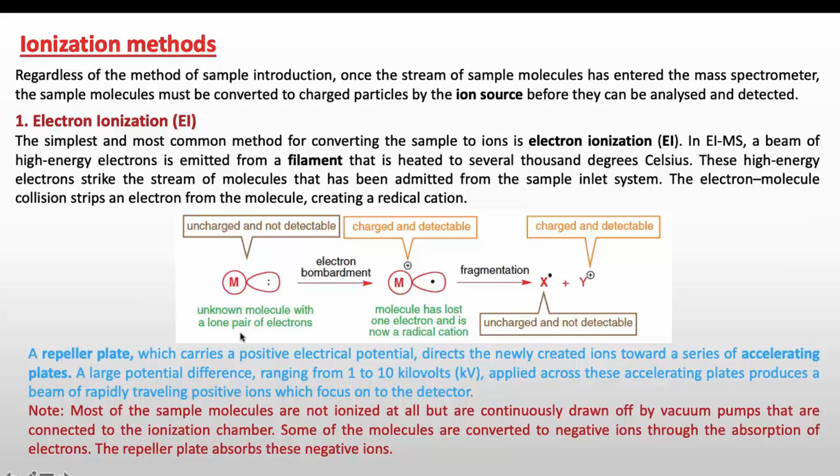The radical cation or cation is useful for us because the mass detector can detect only ions, not radicals or neutral molecules. Now a repeller plate which carries a positive electrical potential directs the newly created ions towards a series of accelerating plates, and a large potential difference ranging from 1 to 10 kilovolts applied across the accelerating plates produces a beam of rapidly traveling positive ions which is focused onto the detector. Note that most of the sample molecules are not ionized when you bombard them with electrons, but are continuously drawn off by a vacuum pump.